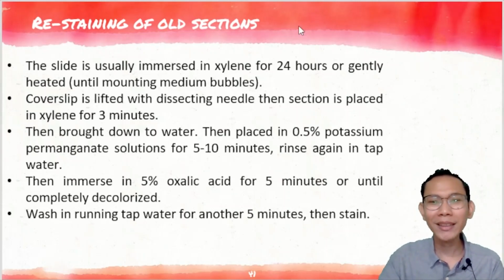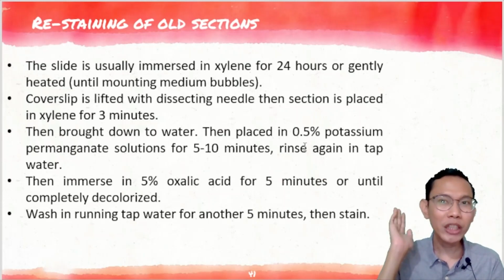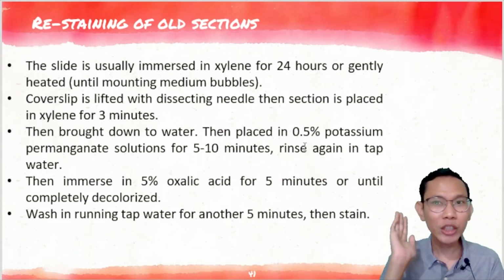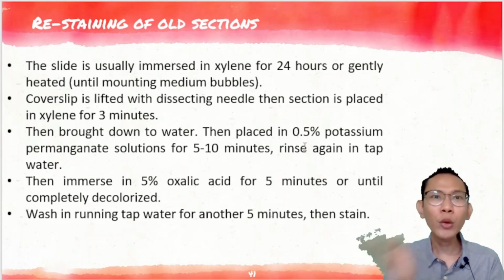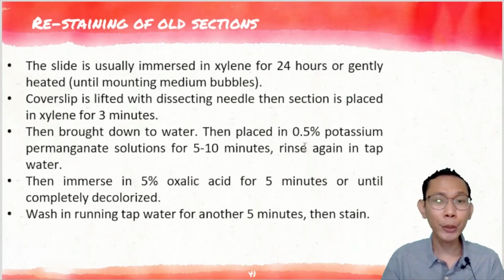Doc, bakit ba natin kailangan i-restain your old section? So may mga times na you have to compare the previous section of a certain patient. So kumuha ka ng tissue sample dati, and then for following years, you check it and compare with the previous section for your proper diagnosis.